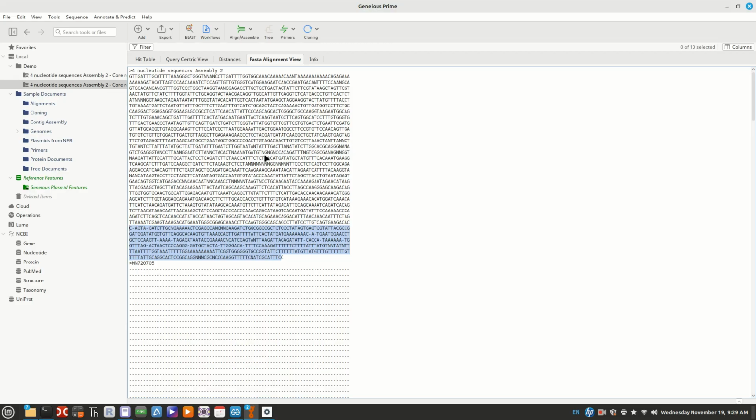Now, I don't know if everybody's going to have this exact same problem, but the very end here, the way I did the trimming and everything didn't get rid of this. I don't know if there's a better way to get rid of it, but that's the problem when we searched. It couldn't find the thing that was actually related because there was an artifact left in it, and we needed to get rid of that. And that's about it.